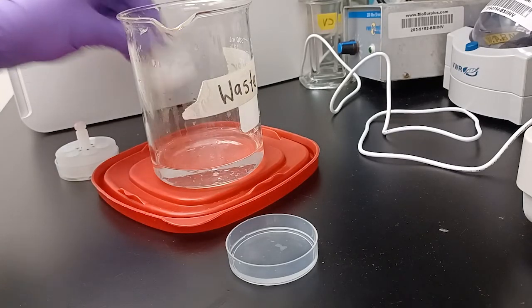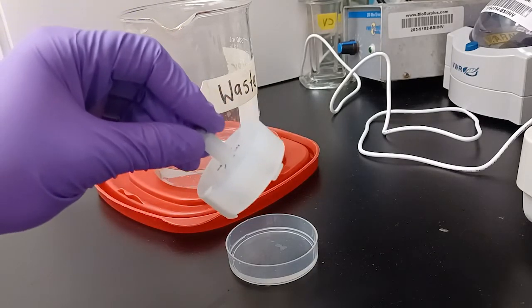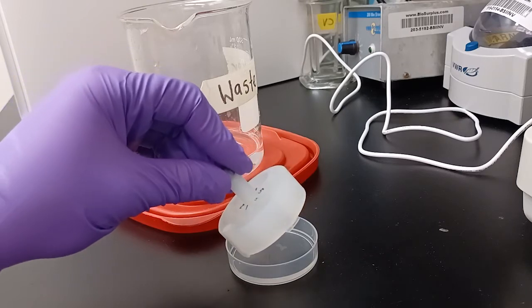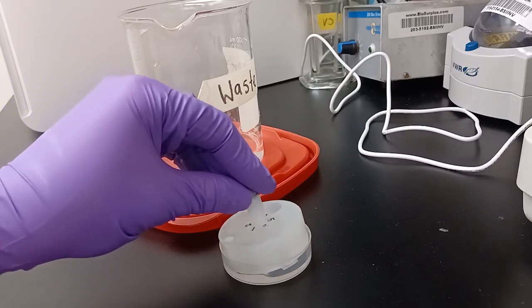Once you have PBS in a basin, lower the netwell insert in at an angle to prevent air bubble formation. Do this for all three netwells.